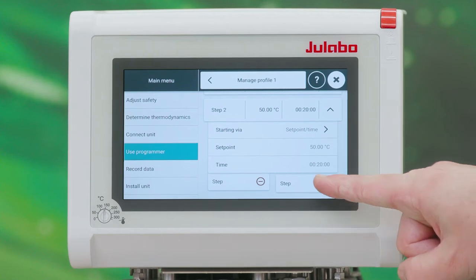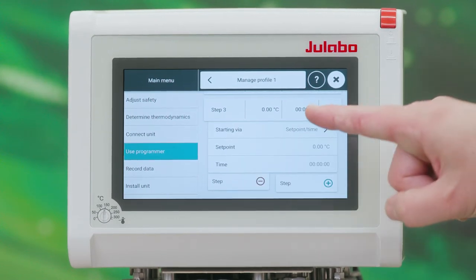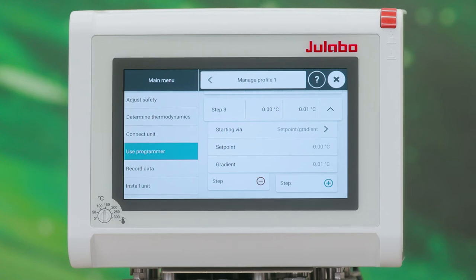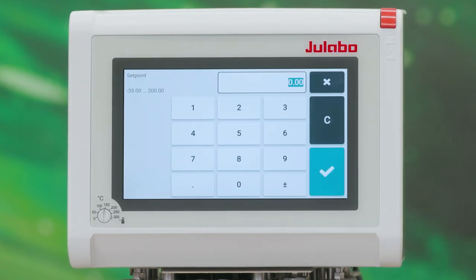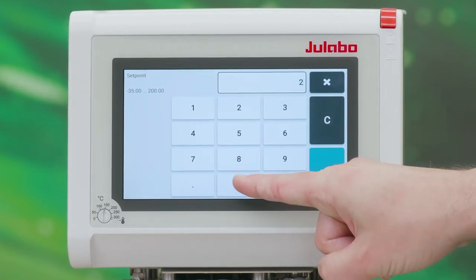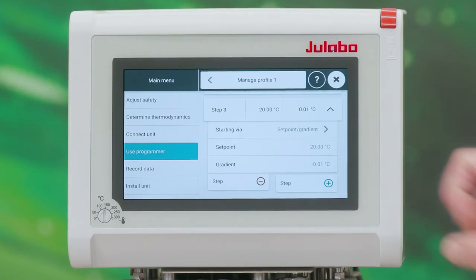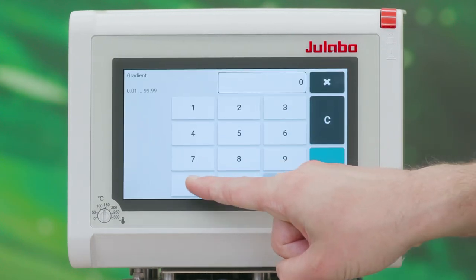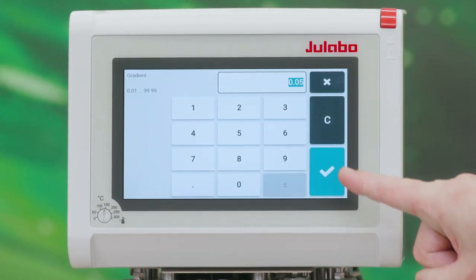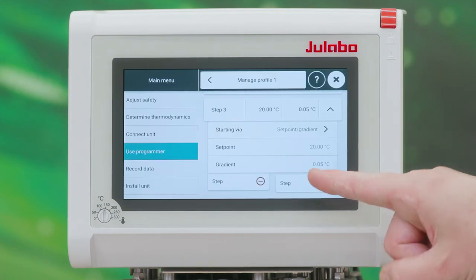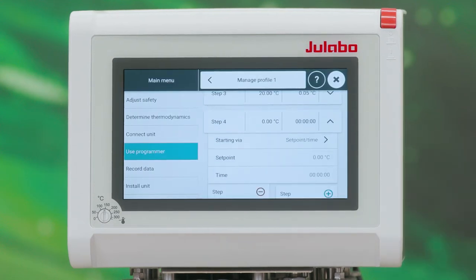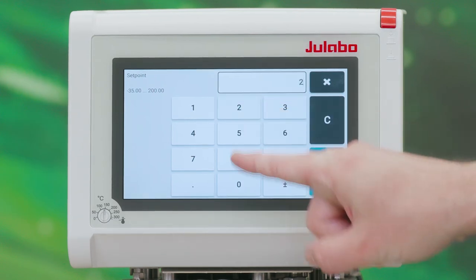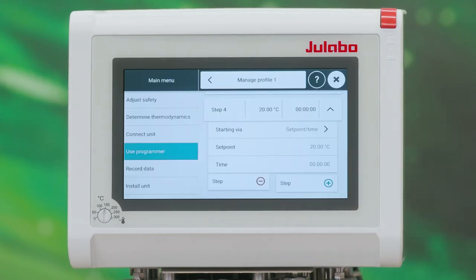For our third step we choose Setpoint Gradient with a setpoint of 20 degrees Celsius, and cool down with a speed of 0.05 degrees Celsius per minute. Our final step will keep the temperature at 20 degrees Celsius for one hour.